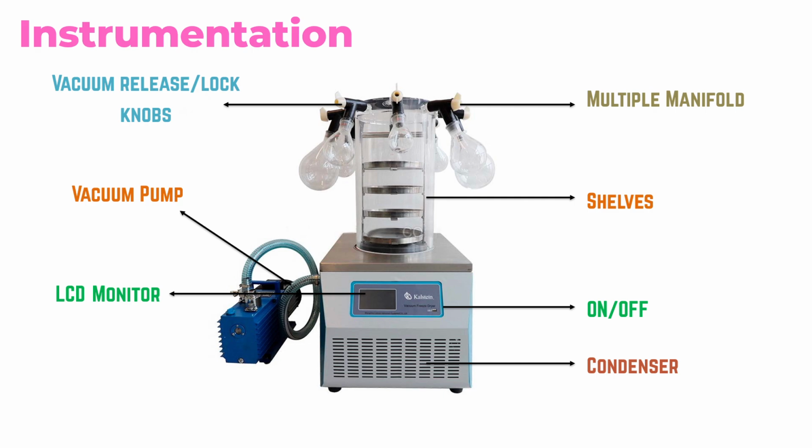lyophilization. So this is the process regarding the standard operating procedures for the lyophilizer, and I have given the information regarding the principle, the basic instrumentation, and the standard operating procedures.